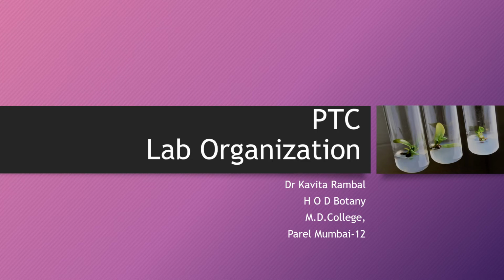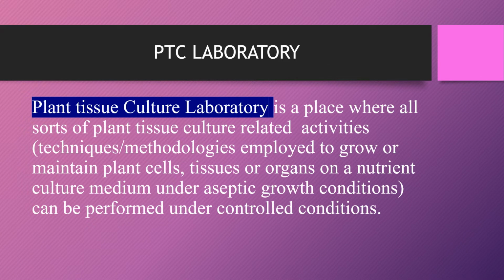Hello students, we have already studied this chapter, that is PTC Lab Organization, and PTC stands for Plant Tissue Culture Laboratory. It's a place where all sorts of plant tissue culture related activities, techniques, you can say methodologies, are employed to grow or maintain plant cells, tissues or organs on a nutrient culture medium under aseptic growth conditions, and it has to be performed under controlled conditions.